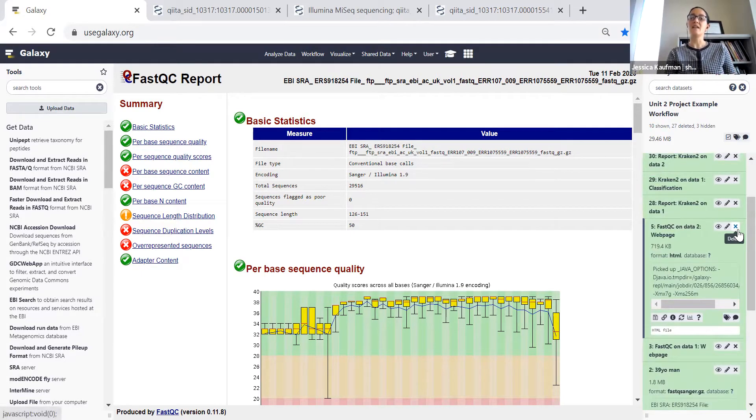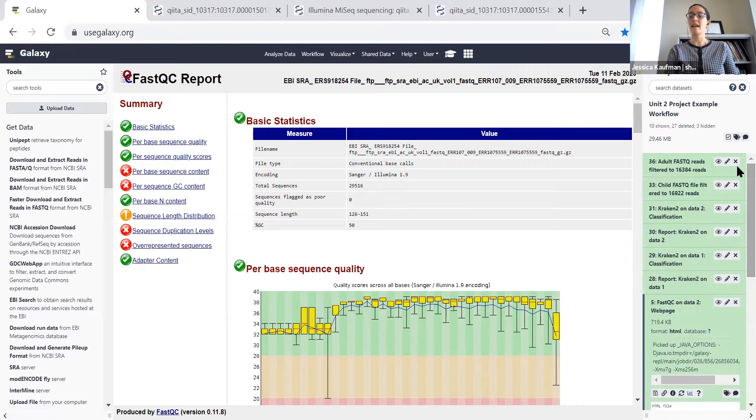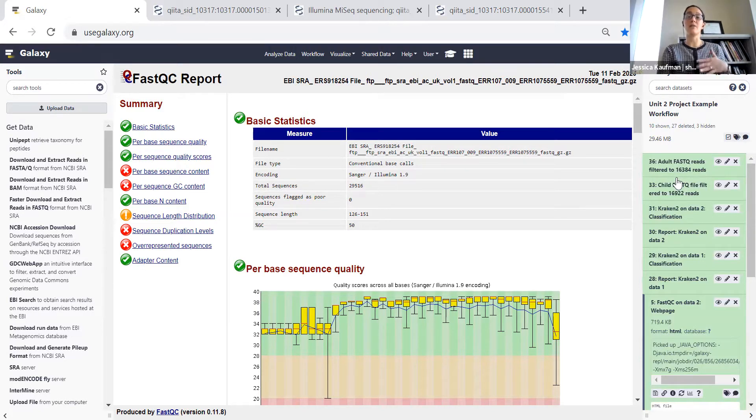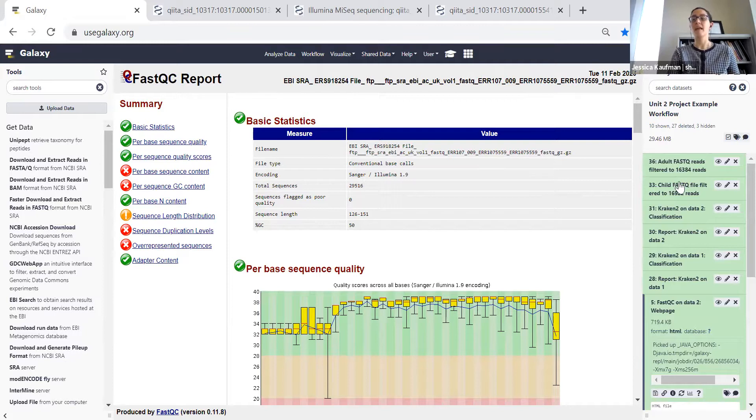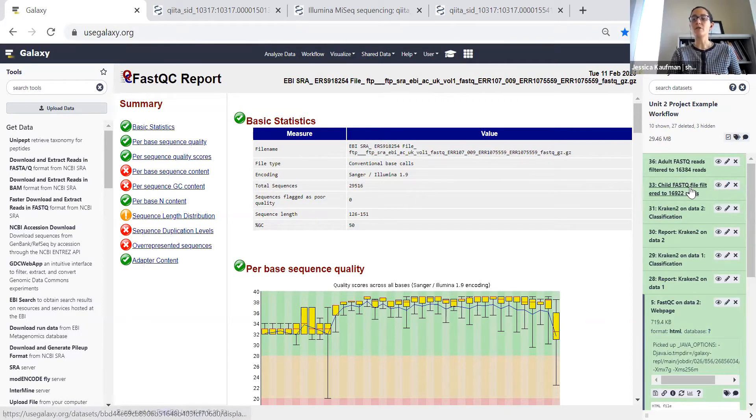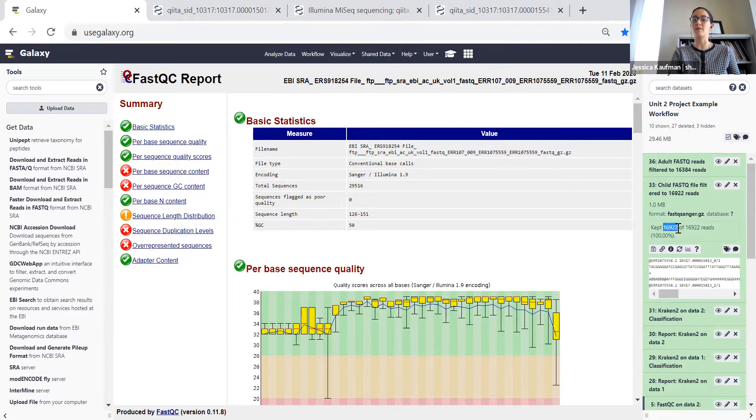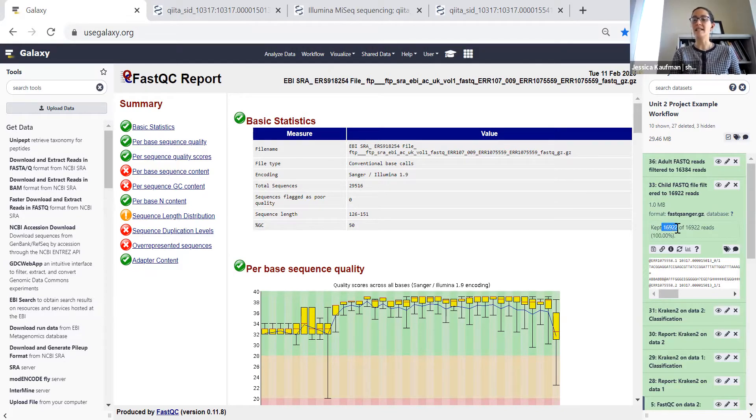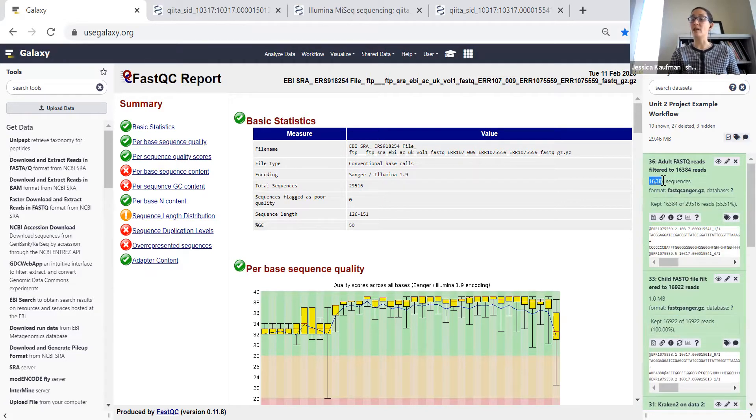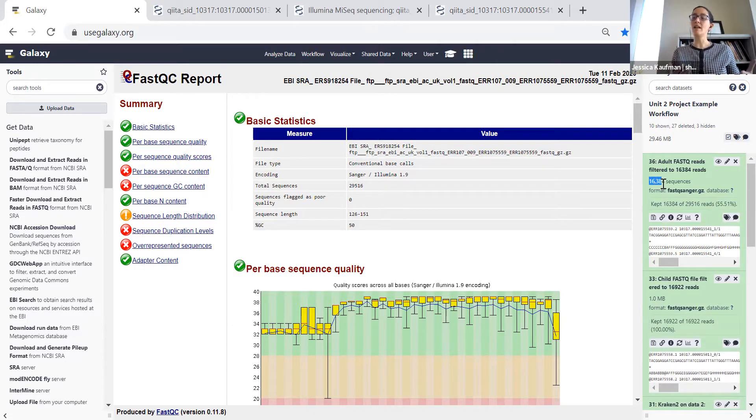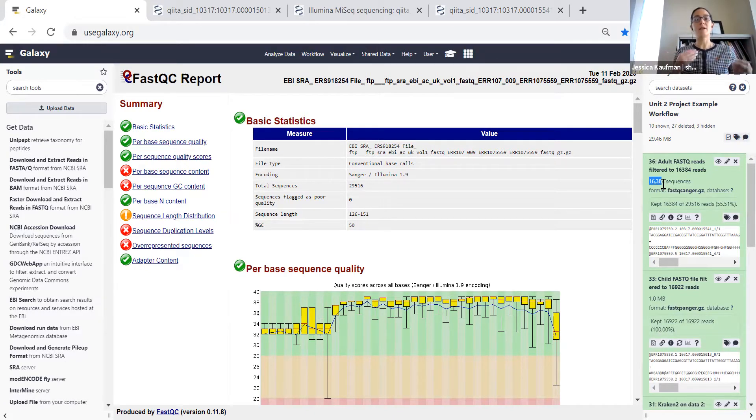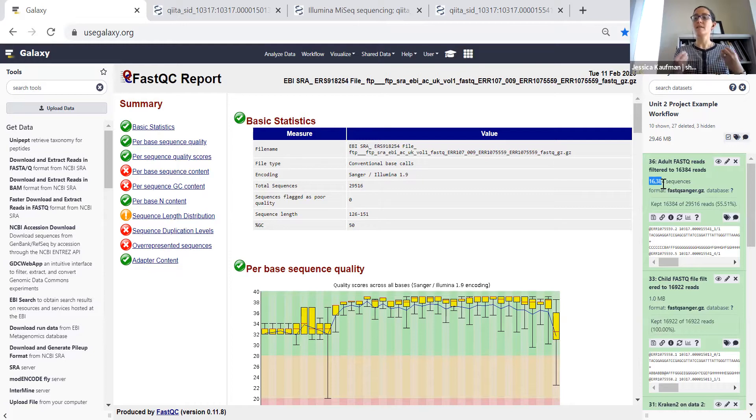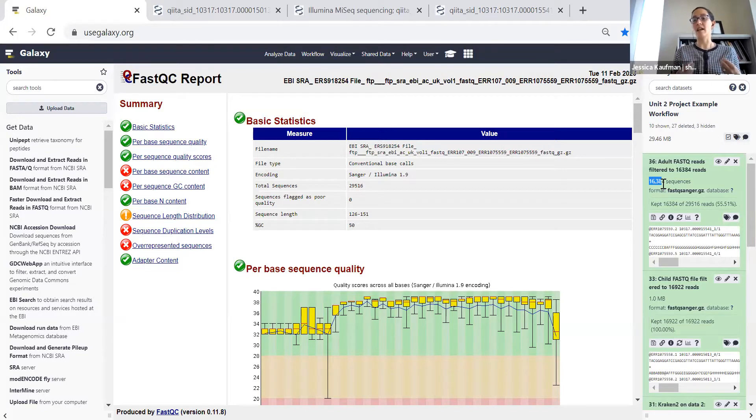Then the last thing you have to do for this week is try to filter the reads so you get them to the same size. Steps 33 and 36 in my history are the result of multiple rounds of filtering. What I was trying to do in these filters is get it to be close to the same number of samples. Now the child file has 16,922 reads, the adult file has 16,384 reads. When I run the analysis next week, I'll be able to compare these more closely. Because if there's a greater number of species in one of the samples, it won't be because it has more reads, it will be because it actually is a more diverse sample.